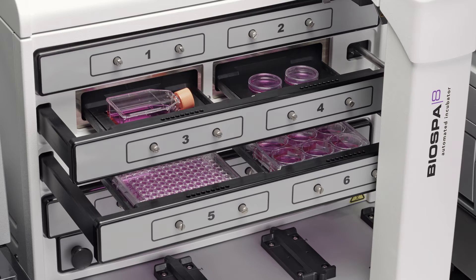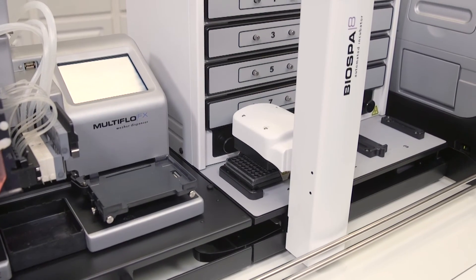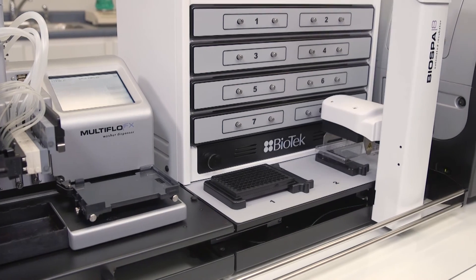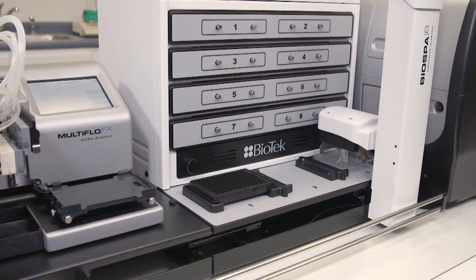BioSpa 8 is compatible with low-density cell culture microplates, high-density assay microplates, as well as cell culture vessels such as T25 flasks. The robotic arm is equipped with a gripper that can handle lidded and unlidded microplates and will automatically remove lids when required.